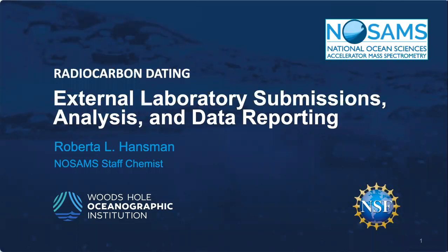I'm the staff chemist at the National Ocean Sciences Accelerator Mass Spectrometry Facility, or NOSAMS, and we are located at the Woods Hole Oceanographic Institution on Cape Cod in Massachusetts. I want to thank the organizers of this radiocarbon workshop for the opportunity to give this presentation, and I'm going to talk about external laboratory submissions, analysis, and data reporting of samples for radiocarbon.